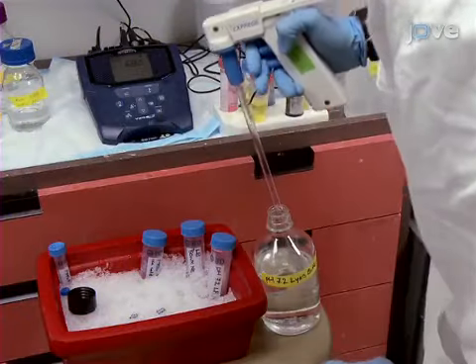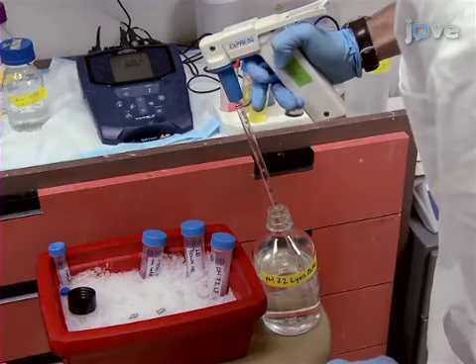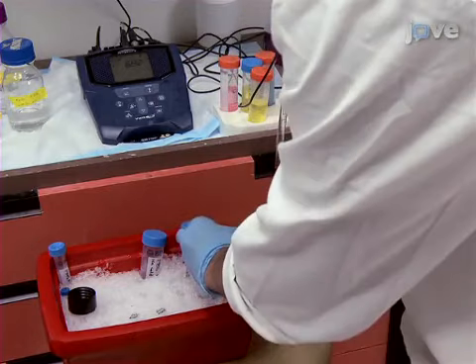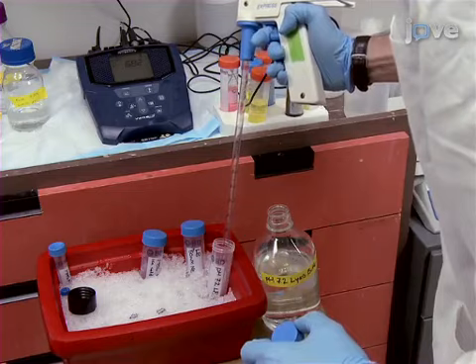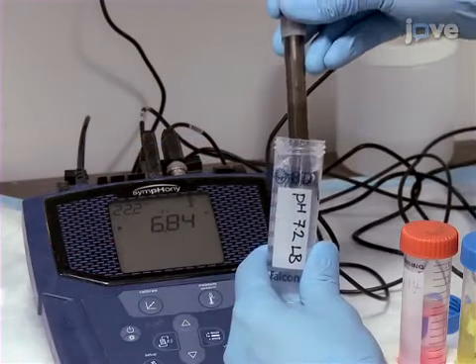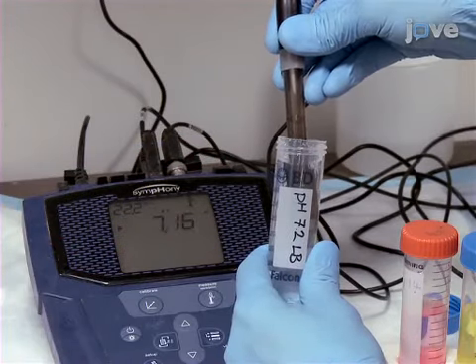In performing acyl biotin exchange, the proper pH and temperature of all the buffers and reagents, as well as their freshness, are critical to ensure a successful experiment. Begin the HAM cleavage with preparation of a number of tubes with lysis buffer of different pHs. The pH is very important for these steps and should always be adjusted using a pH meter.